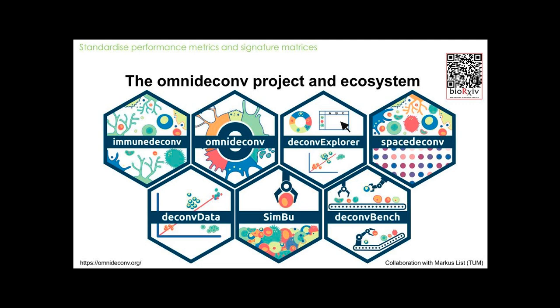The idea of this blend of seven packages is to streamline the deconvolution of bulk omics by providing a curated and unified interface to a variety of the most popular gold standard deconvolution approaches. For example, immunedeconv, for deconvolving bulk transcriptomics samples without relying on single-cell references, is often mentioned as the first generation of deconvolution approaches.